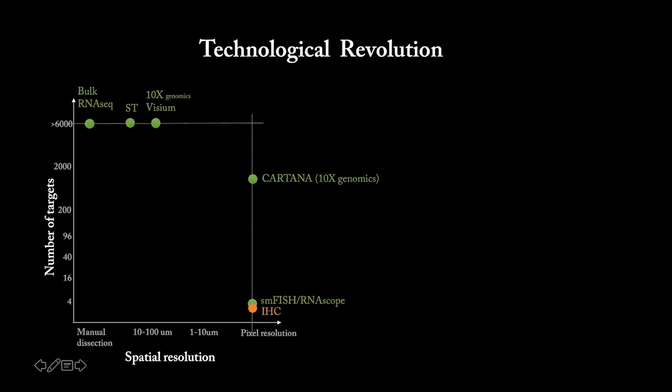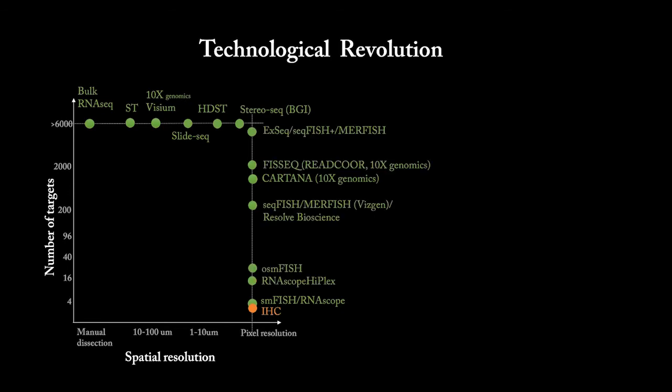neuron pathologies. And after we identify such a network, we want to increase the capability to multiplex RNA detection in pixel resolution. That will help us understand the complexity of the cellular response to such a microenvironment of the neuropathogenic hallmark. However, recently there are a lot of new technologies coming in, either 2D RNA sequencing arrays to increase the spatial resolution, or more options that help us multiplex RNA detection in pixel resolution and acquire this information by microscope.